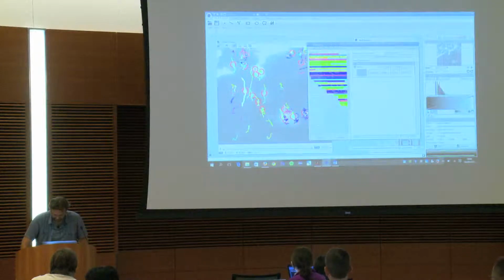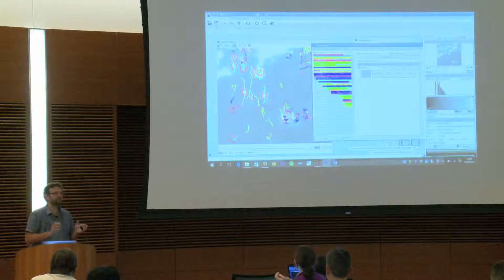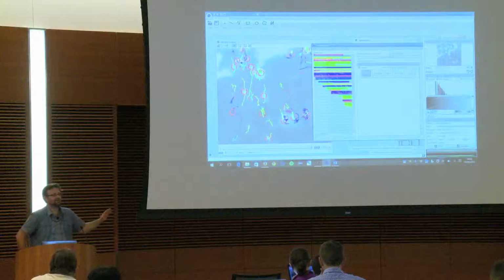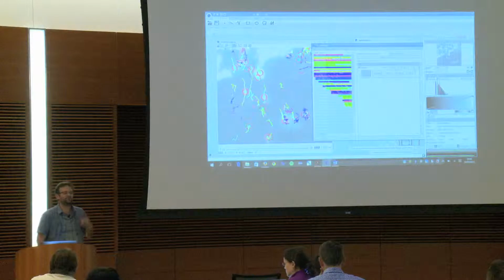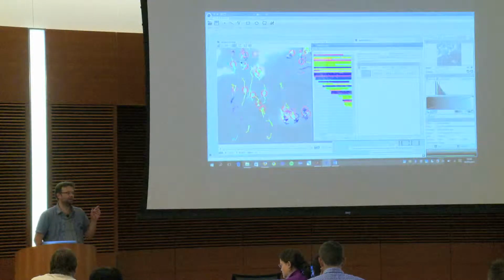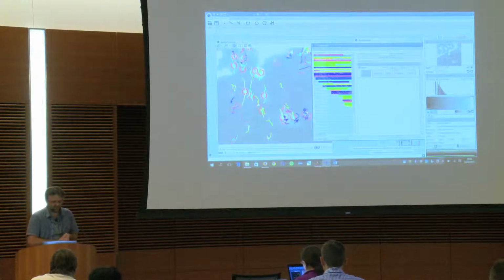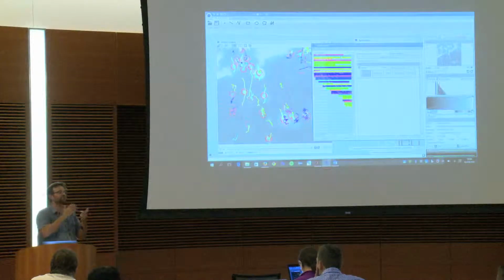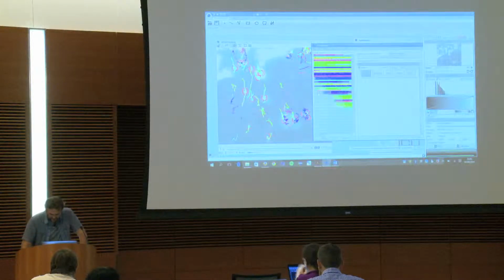Oh, okay, not this time. And here you have backslashes, meaning that the tracking created a detection somewhere where the tracker thinks that the detection missed something. But it is something that you can tune. You can say, I'm 100% confident in my detection, so I dare you putting a detection in my set. Or you can say, I'm really not confident, and then the system is going to add a lot of them. You can also put the probability of appearance of the particle. I mean, you can tweak it. And so here you have all the tracks.